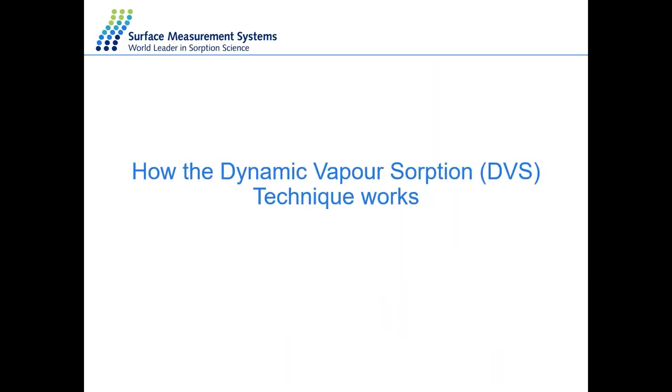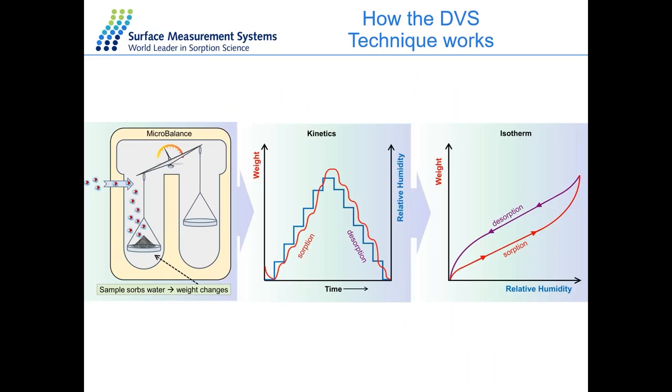A standard experiment will be designed in a very simple, staged way. We will have an initial drying stage, and then we will generate a constant level of relative humidity as a first step, let's say 20% or 30% or 40%. Then we increase the relative humidity, and we check the mass automatically. The software does it for you.